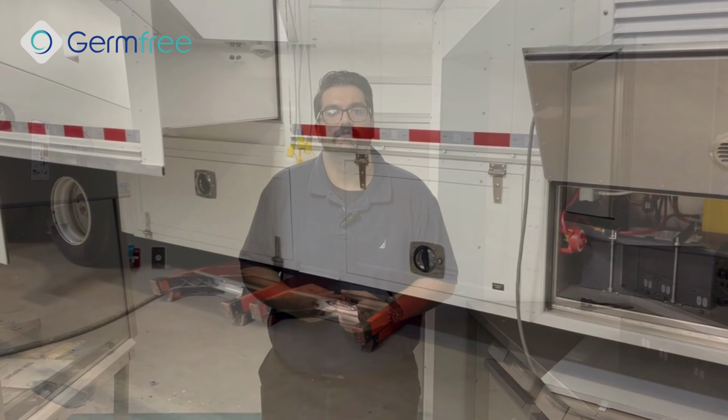Being that it's going to Canada, one of the other harder parts of this project is making sure everything is winterized. So this trailer is required to operate from minus 40 degrees Celsius all the way to 30 degrees Celsius positive, which is a huge temperature range. And being in a mobile platform, it presents its own challenges. So everything is insulated and sealed. In the case of this trailer, as mentioned earlier, we have the heated floors to help out. Everything's got to be winterized on the plumbing, so we don't have issues there. But it was a lot of design thought and a lot of coordination between not just Germfree's team, but also the trailer manufacturer and the end user.